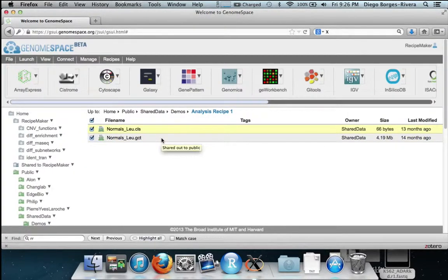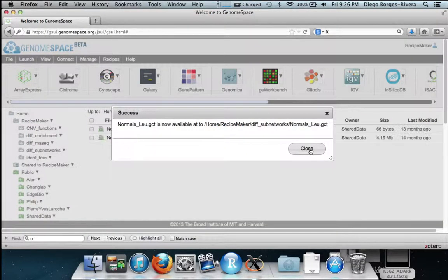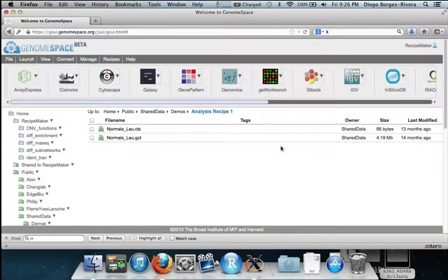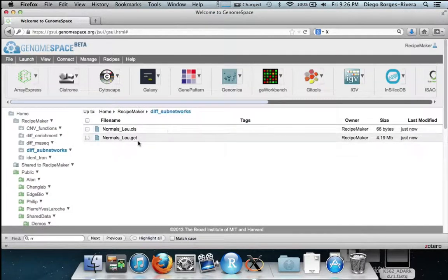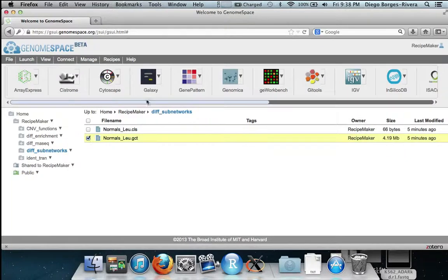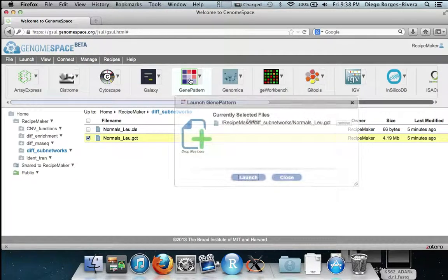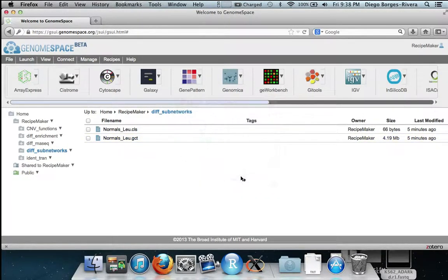We now go to the subdirectory and we select the GCT file which is the GenePattern common expression format and hit launch.